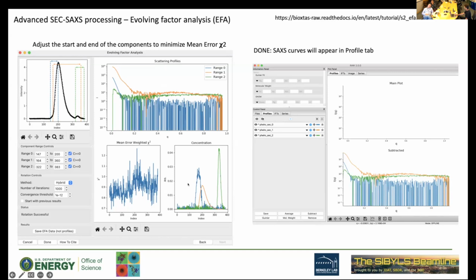And in this case, the little aggregates, or whatever this is, higher oligomers, or as John mentioned, condensate, are coming up first here and are overlapping our main peak. That's why you see how important it is to do the deconvolution, especially when you see that the residual deviation is not stable across the peak. I would use it all the time, especially when you use this tool. It's pretty easy to navigate. And then you get even better signal-to-noise data if you do the EFA.